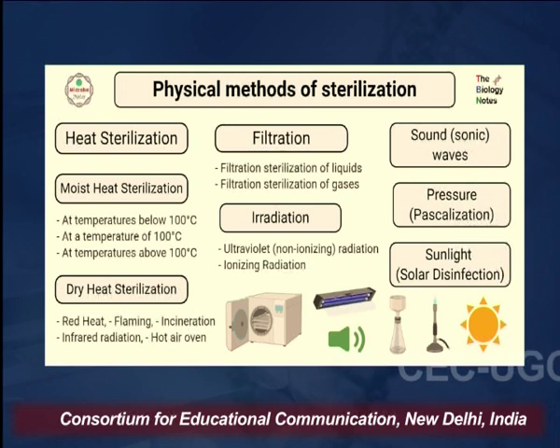Other physical methods involve sound, which is sonic waves or ultrasound, pressure, and the use of direct sunlight or solar disinfection, though the last three methods are less commonly used in the labs.